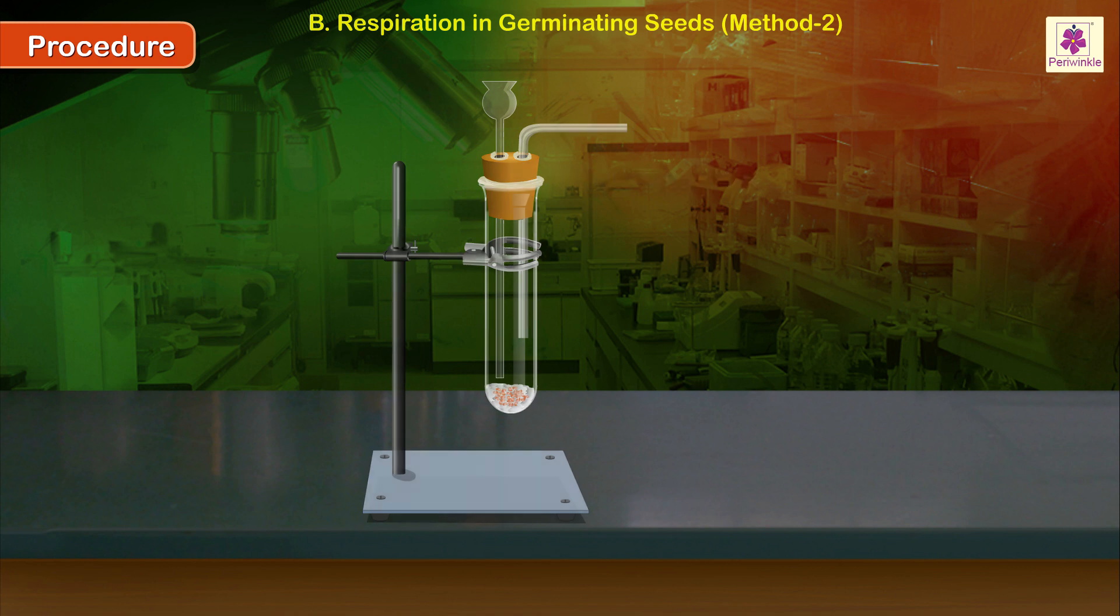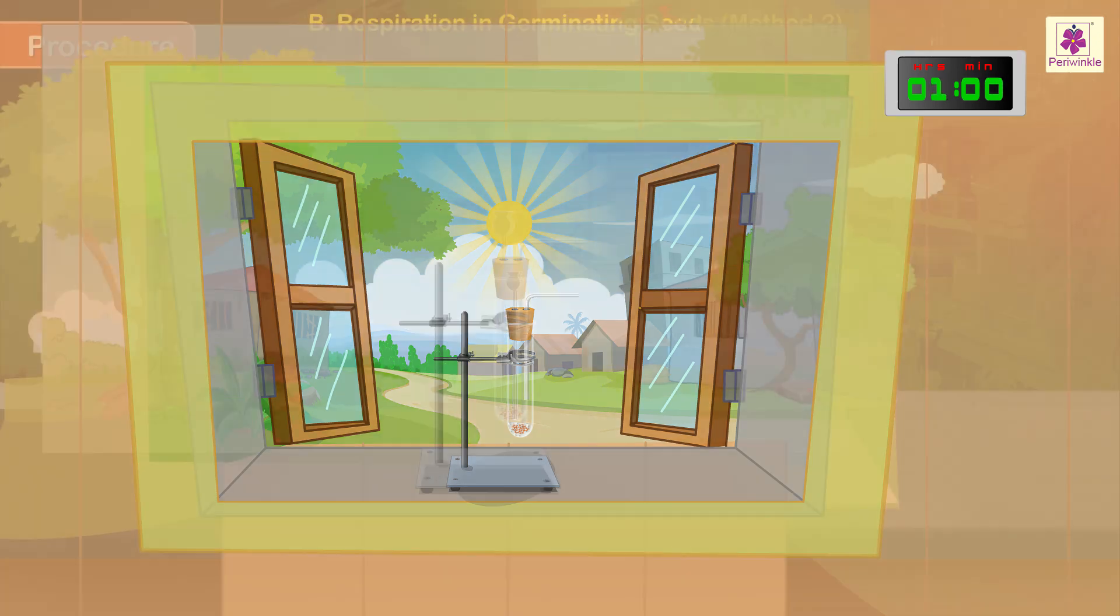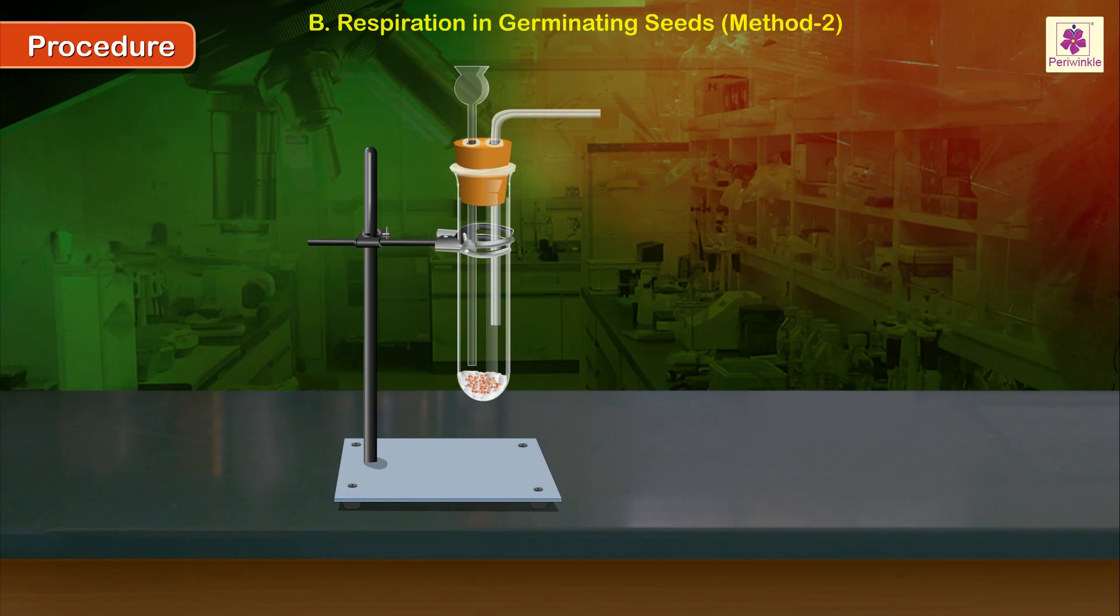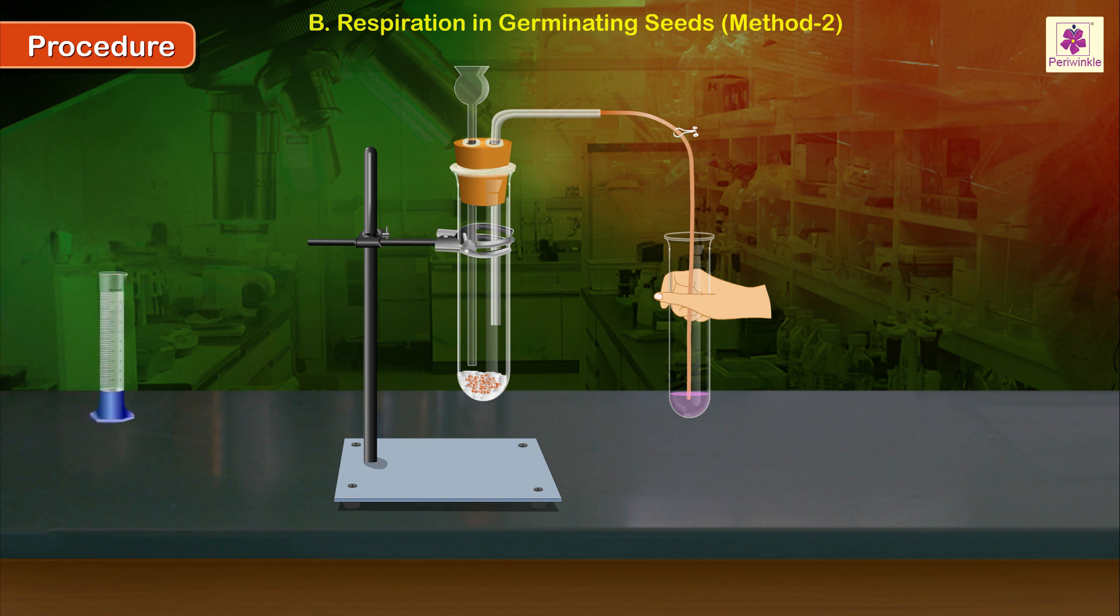Place the experimental setup in bright sunlight for one hour. Dip free end of the rubber tubing into the test tube containing phenol red solution. Release the pinch cork. Pour 10 ml of water through the thistle funnel into the boiling tube.